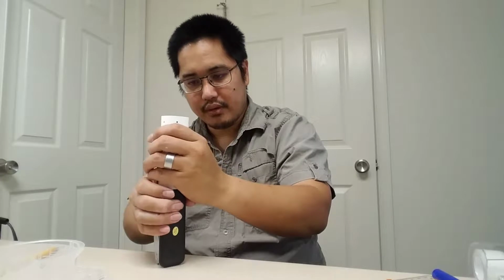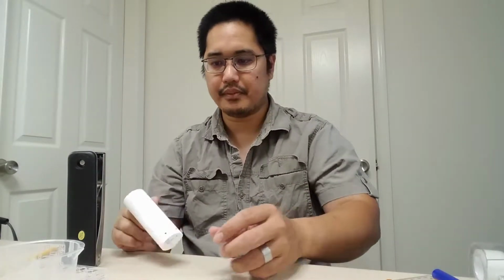Almost. There we go. And I'll do one more right in the middle, just to add stability. There we go. I've got my stapled tube of paper.